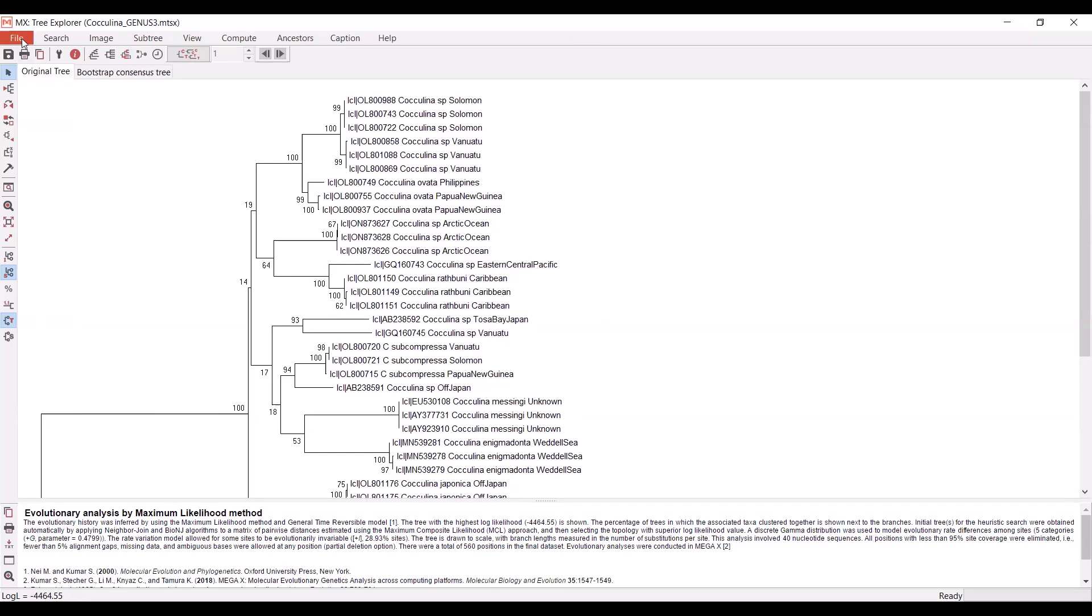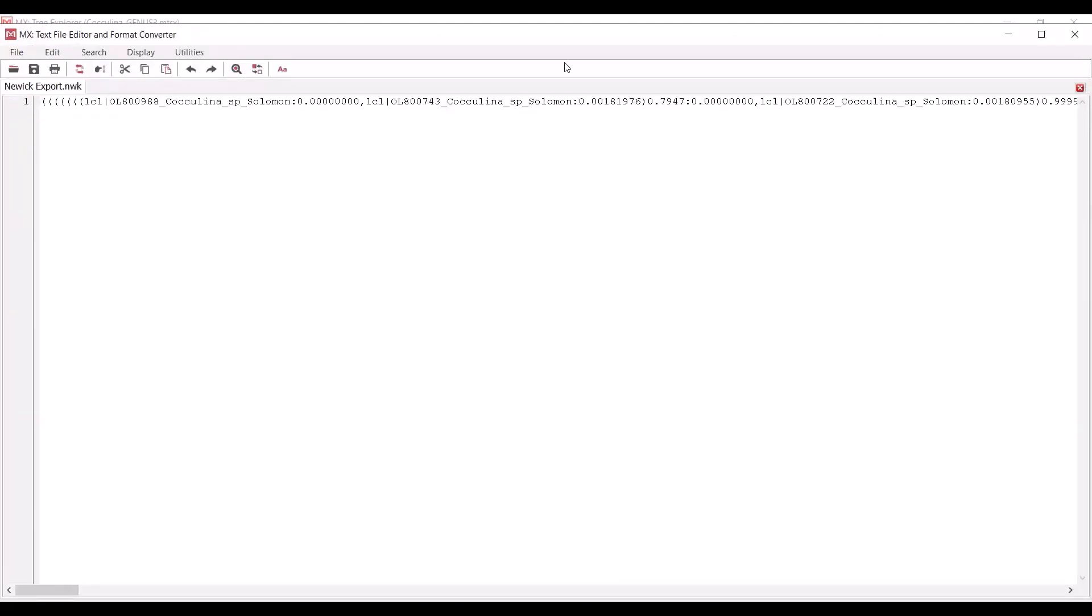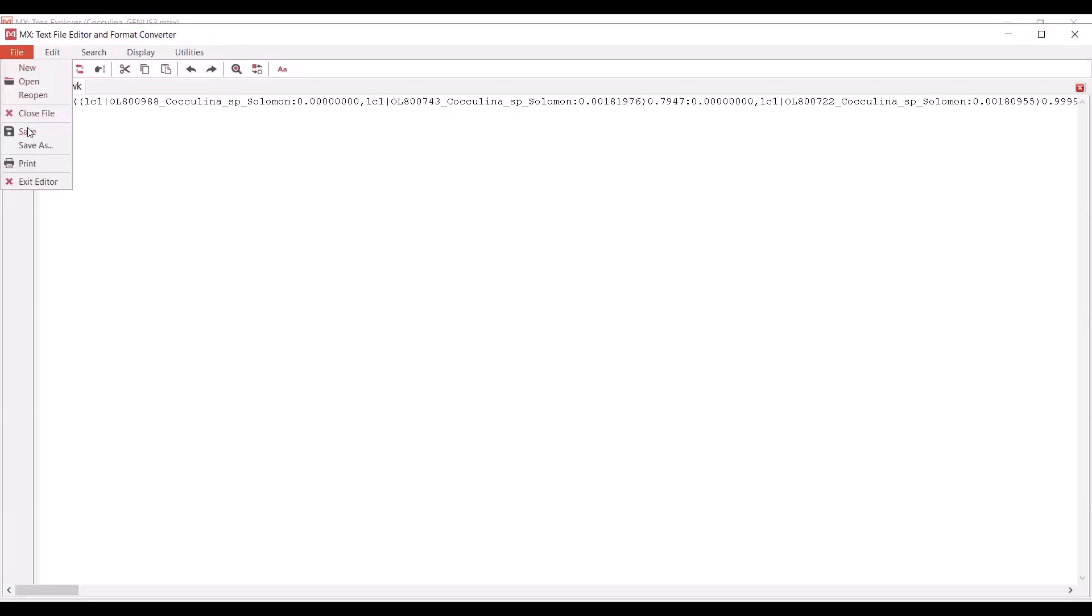But to do that, you need to export this tree in a very particular way. If you go up to file, you can save the current session as a MEGA file. That is readable by MEGA. You can pull this window back up anytime you'd like. What you will need to do in order to edit in FigTree is export the current tree in the Newick format. If you select that, you want to make sure that you select both the branch lengths and the bootstrap values to be exported. Then you hit OK. What you should see is a window like this, where it essentially translates your tree into a different file format. This file is going to be readable by FigTree. You can open this in FigTree and you'll see your phylogeny there. You'll want to save that and then you'll be good to go to create your figure.